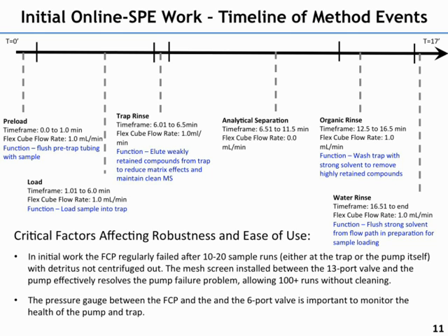And then we execute our analytical separation over about 5 minutes. And then there's some re-equilibration and rinsing steps at the end. So this is a pretty typical protocol for us.